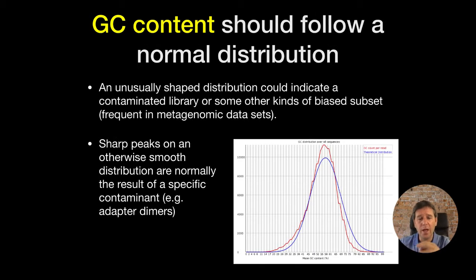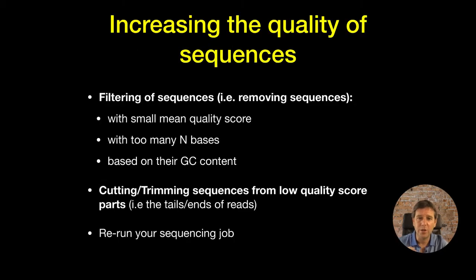You also can look at the GC content. This is a little histogram produced across our data set, and it's usually normally distributed like we see here. And if you have sharp peaks or other strange things on these distributions, again, this is going to indicate some problems, probably contamination, or that adapter is left in there, or something that we don't want to see in our data that you'd want to pay attention to. We're fine in our case, and we can go on to look at these data sets with other methods.